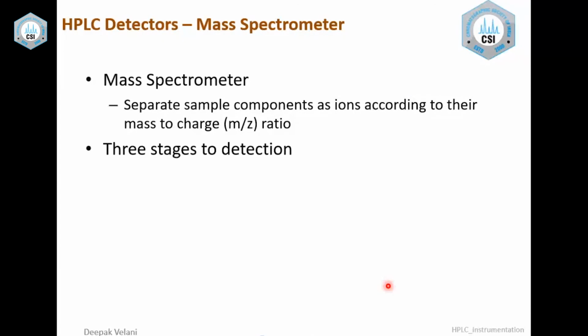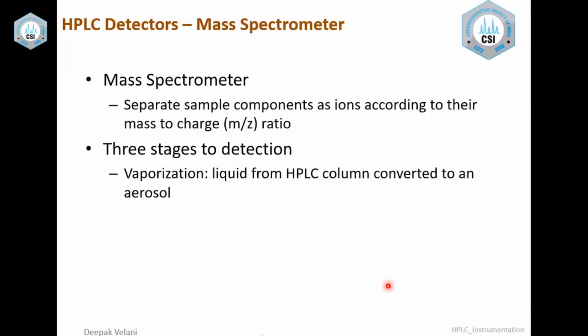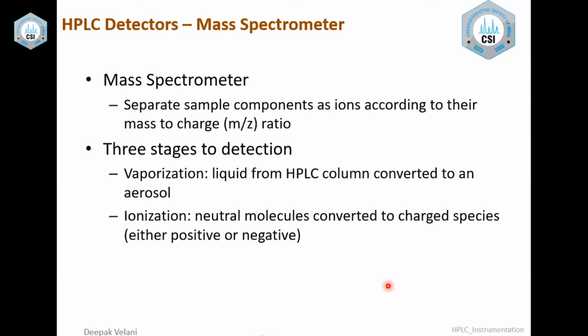Mass spectrometer is a very good detector, and like the diode array detector or photodiode detector, this also gives a third dimension. There we got wavelength. Here what we got is the mass of a particular component or compound. The detection is definitely m/z. Multiple charge proteins, which are large molecules, can also be detected with this detector. That is an advantage here. And basically we have to ionize, as I said in the earlier slide, that if you can ionize, I can recognize. So this is the simple theory of mass spectrometer.